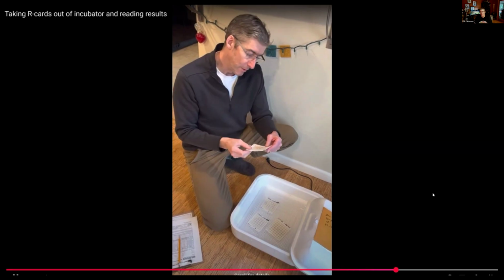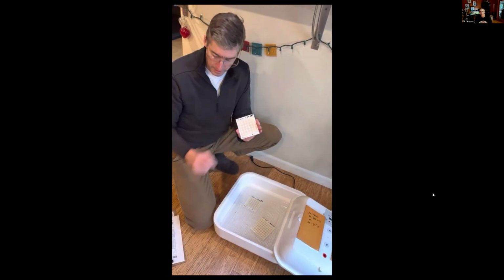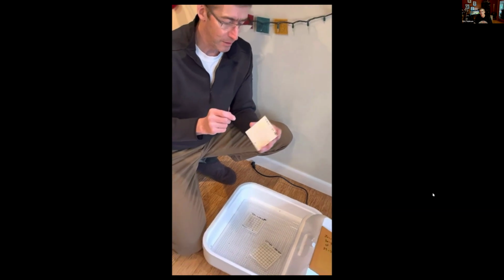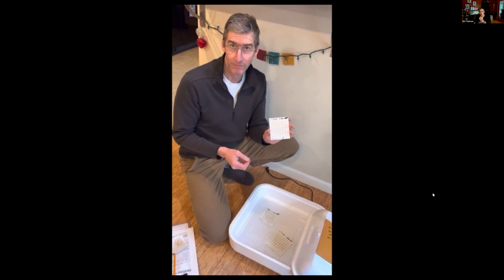Then what we would do is count up the number of dark blue dots and record that as our E. coli results, count up the number of pink to purple dots and count that as our other coliform, and that's how we record our result. We'll just record that on our data sheet.